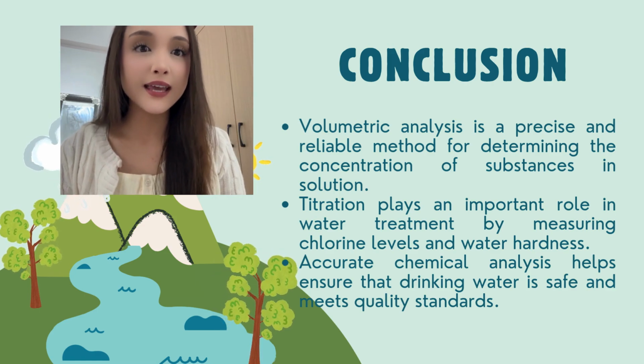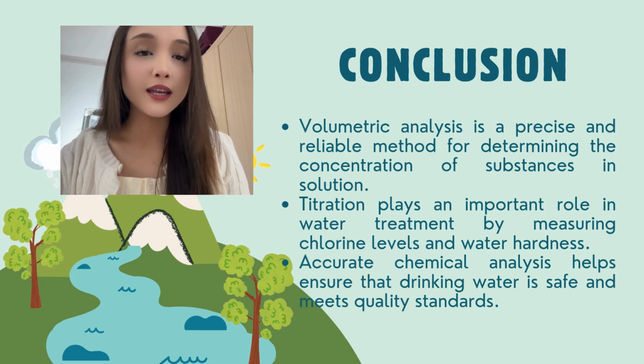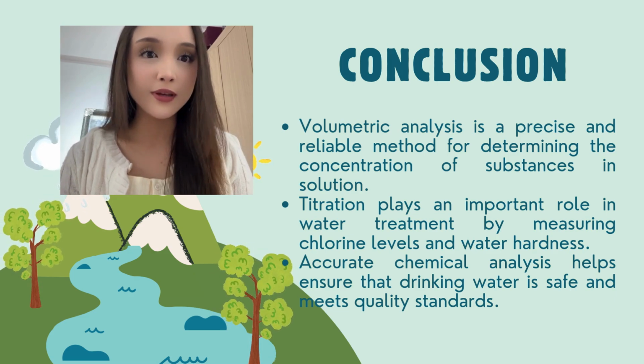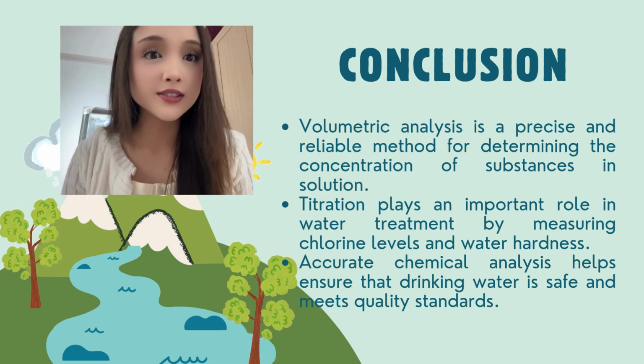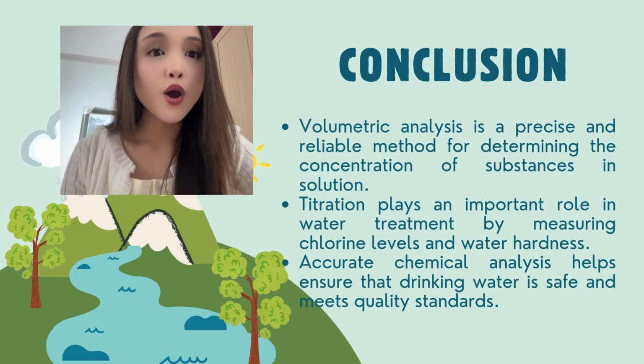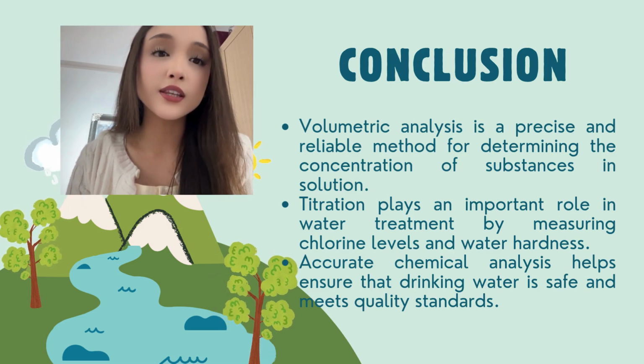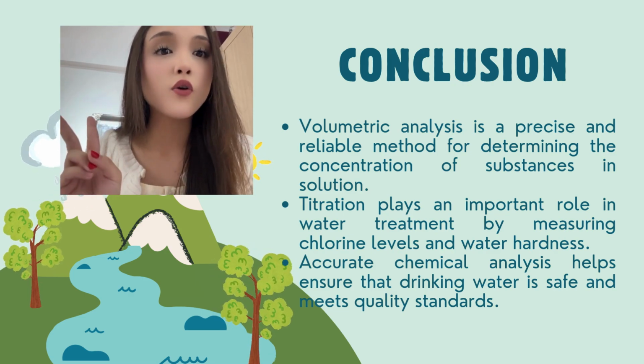Throughout this presentation, we have seen how titration is used in water treatment to monitor chlorine concentration and water hardness, ensuring that drinking water meets safety and quality standards.